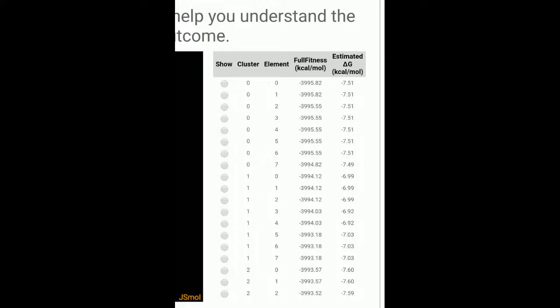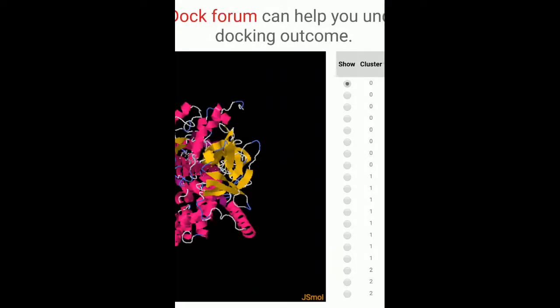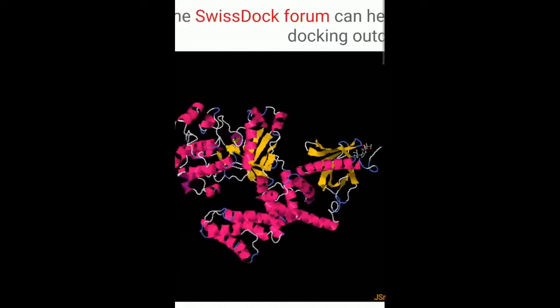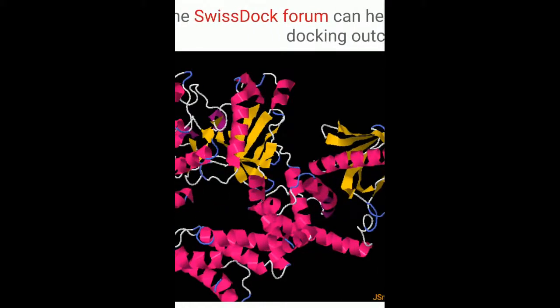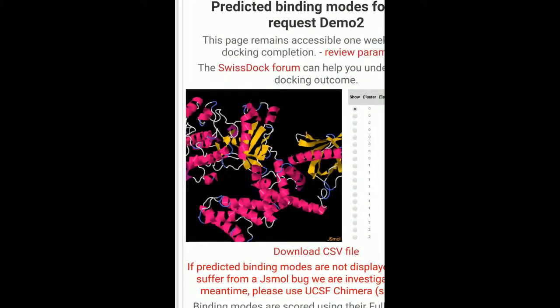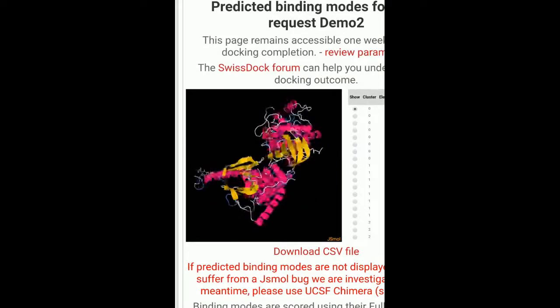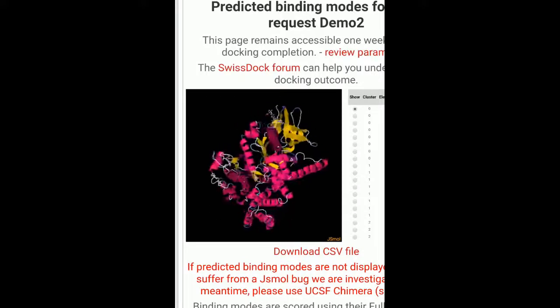If I select on this one — that is 'Show' — this is the pose of the 0th position. Like this, you can view the poses for all of them.